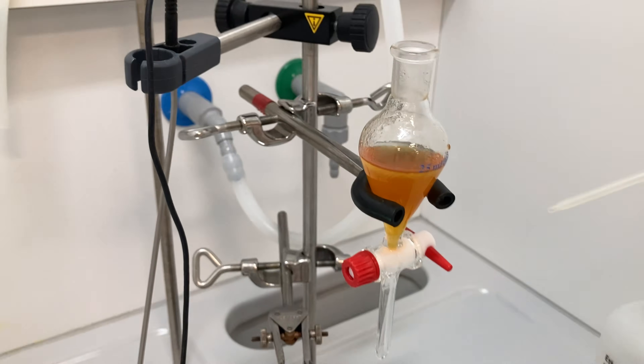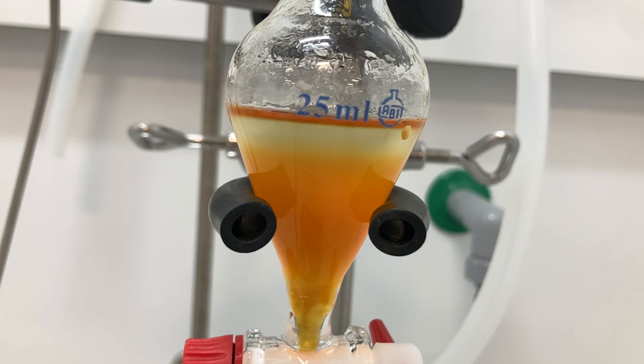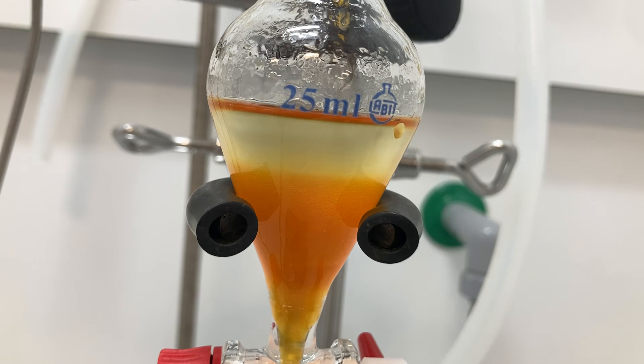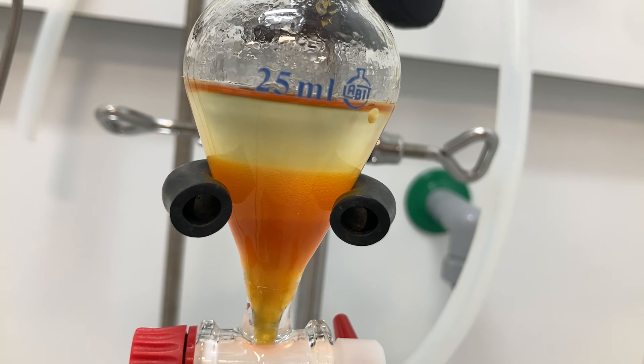After combining the organic extracts, I dried them over sodium sulfate, filtered the solution, and concentrated it under reduced pressure to obtain a crude residue ready to be purified by flash column chromatography.